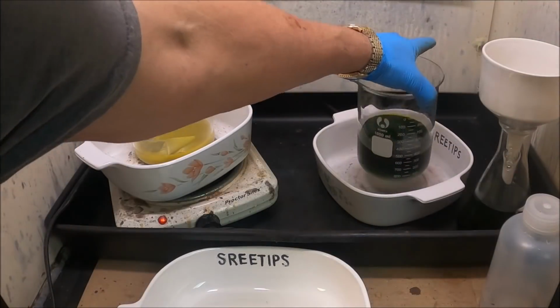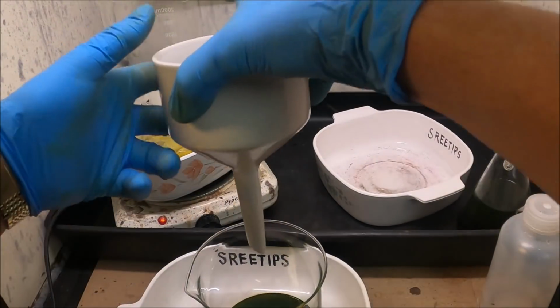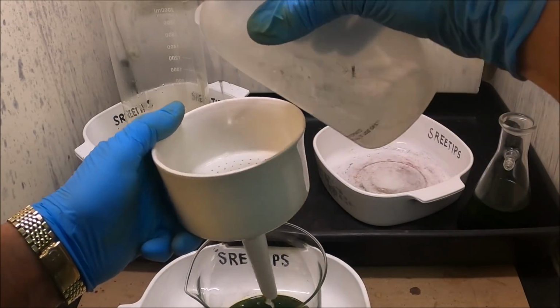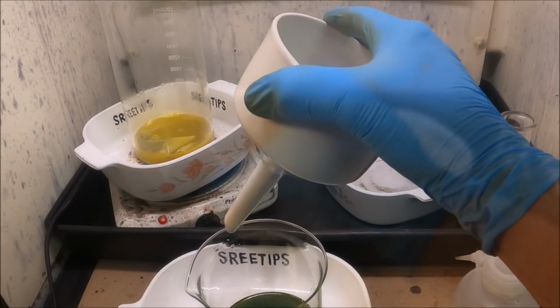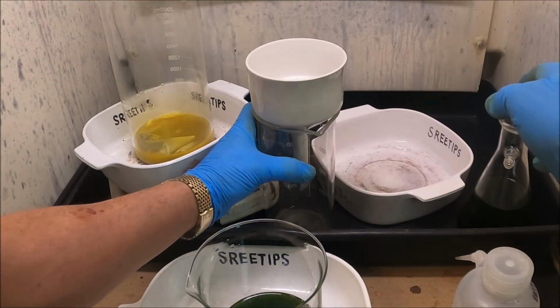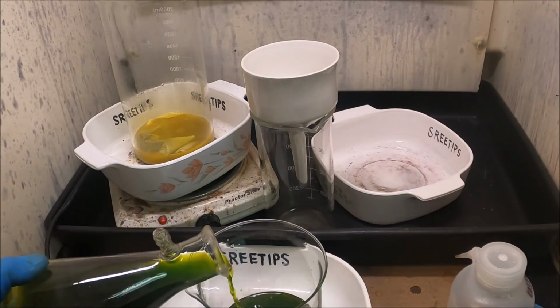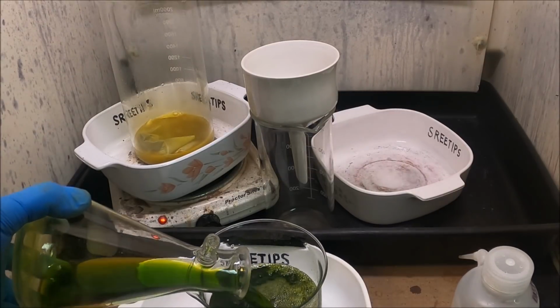All right, let's pull our solution up here. This is going to have our gold in it. And what we're going to do here is rinse everything into this single beaker right here. Get this back out of the way. Next, we're going to pour this solution in. So we got all of our solution in one spot.